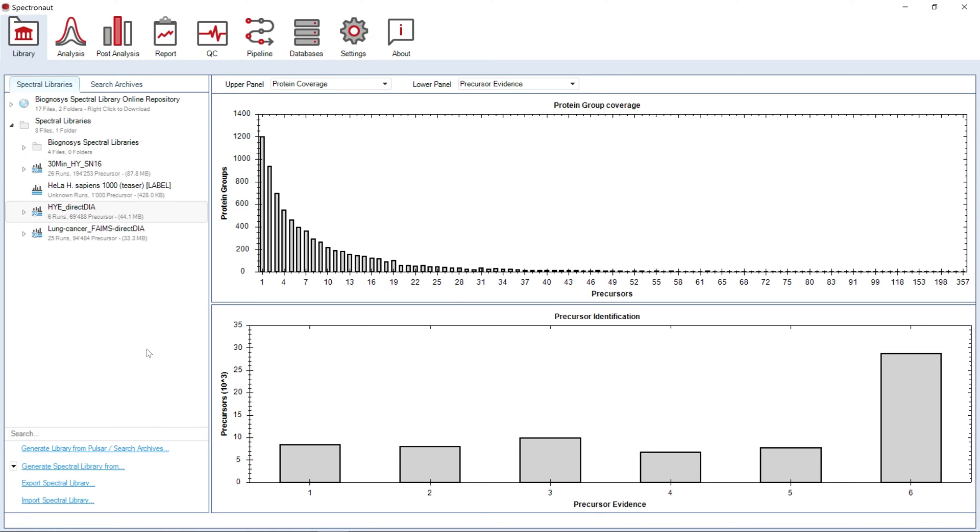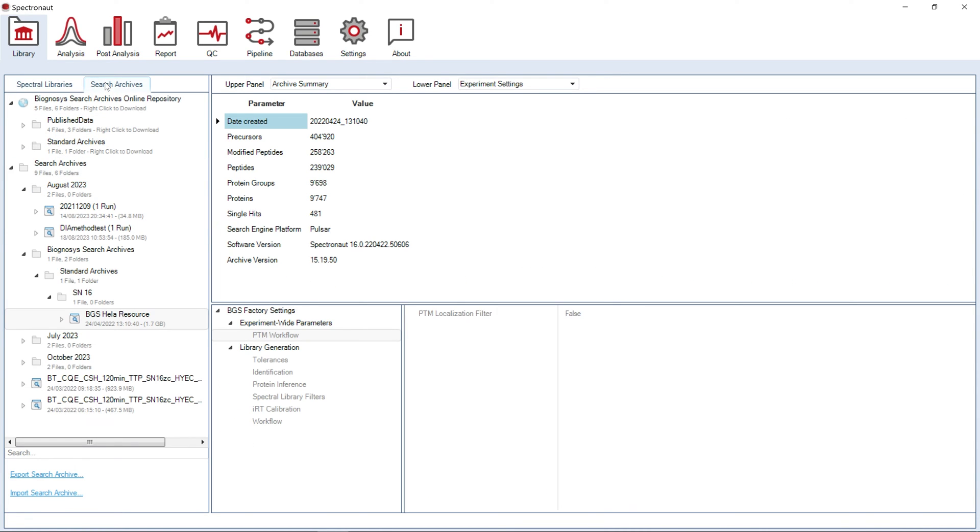Every time a search is performed, Spectronaut will save the results PSMs in a search archive. These search archives can be used to generate new libraries without the need for searching previously processed runs from scratch.